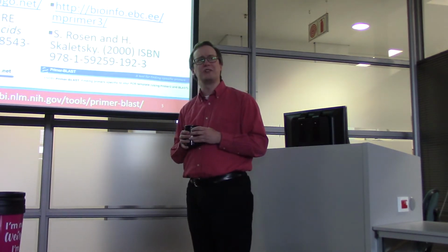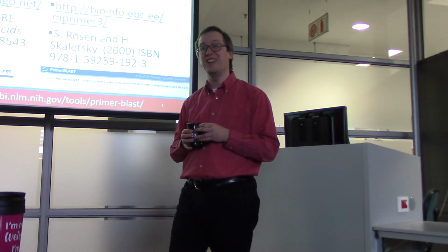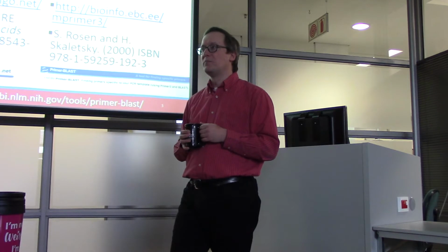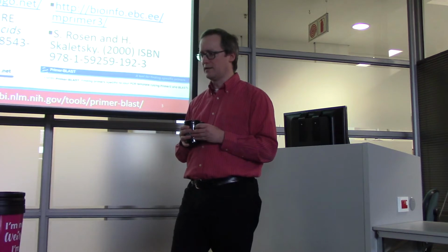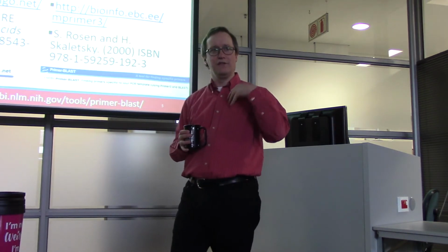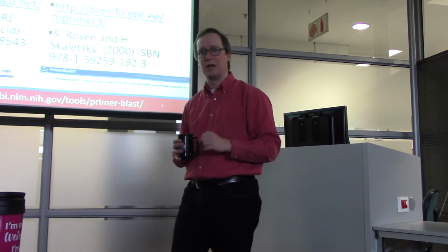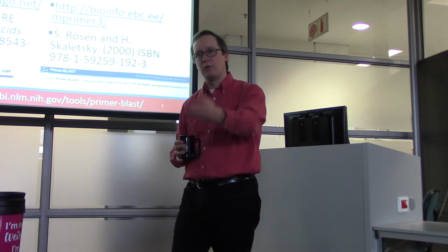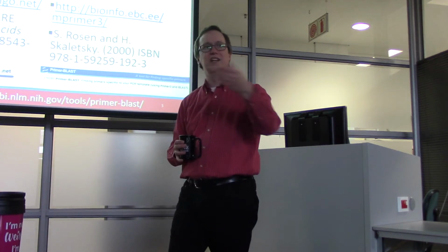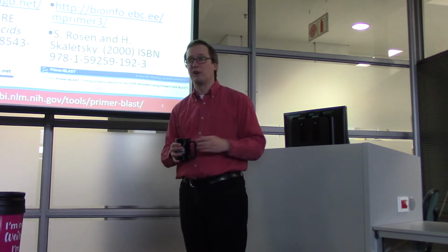This is, I believe, commercially available software. This is something that we don't talk about a huge amount in bioinformatics, but it's something we think about, certainly, which is to say that some software is commercially supported and closed source, and essentially, if you're going to be able to do something with that software, it's because the developers behind that software have given it that capability. But you, as a user of that software, don't have a lot of power, perhaps, in directing where that toolkit is going to go in the future. On the other hand, you're probably going to be able to get commercial support for it, so that's lovely. So on the left, we have that option.